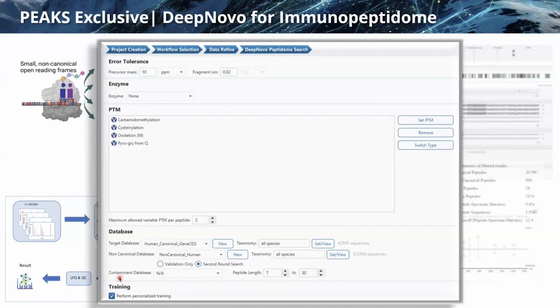Basically, once we have the identification result, we reevaluate this result based on the training on your given data. So we look for motifs within your samples or experiment, and then we recheck if there were any candidates where the scoring could be altered and a more personalized result produced.